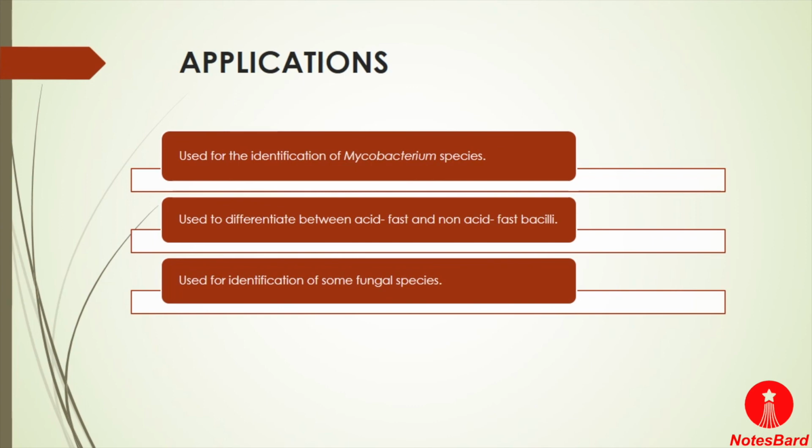Another application of this method is the identification of some other species also, like Cryptosporidium and many other species which can be identified by the method of Ziehl-Neelsen staining.